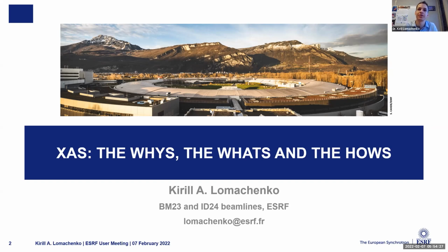It's very nice, but to have a multiple edge EXAFS fitting, I think it's going to be hardly possible. First of all, because EXAFS at carbon and boron is difficult, and then because the experimental conditions will be just too different to have the same common parameters in the EXAFS fitting.